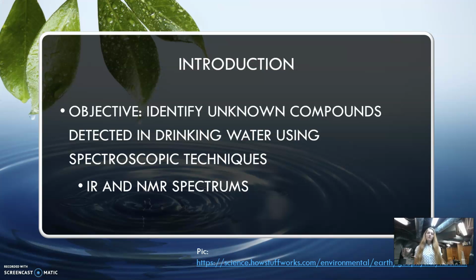So that was just a little beginning, but going straight into my presentation and how that ties in, what I will be talking about is the IR and NMR spectrum of an unknown compound, and that will help give you some knowledge on what type of water you could be drinking and what could be in it.